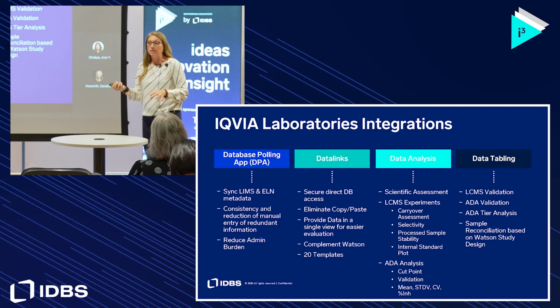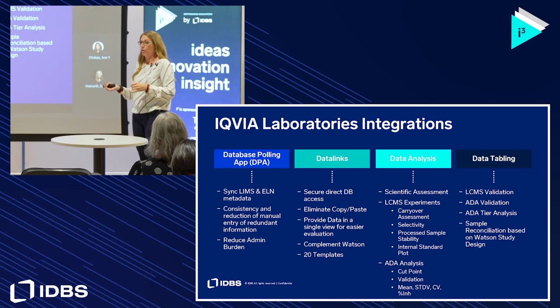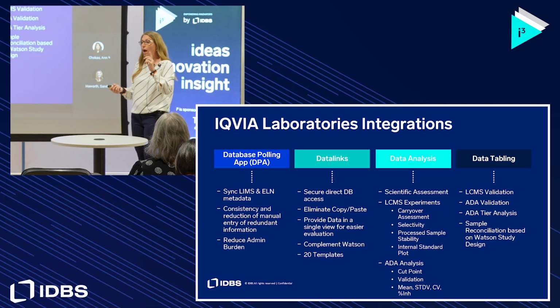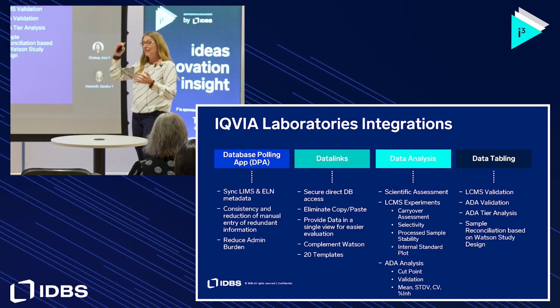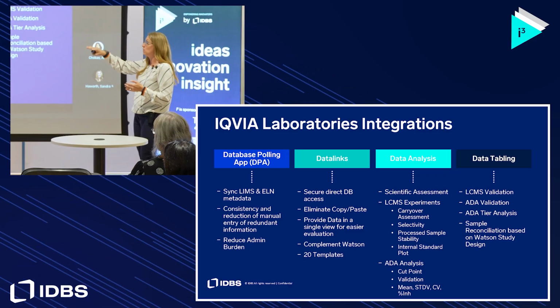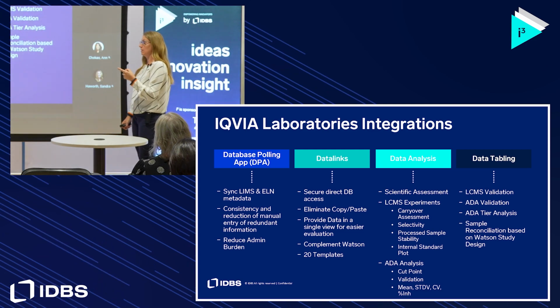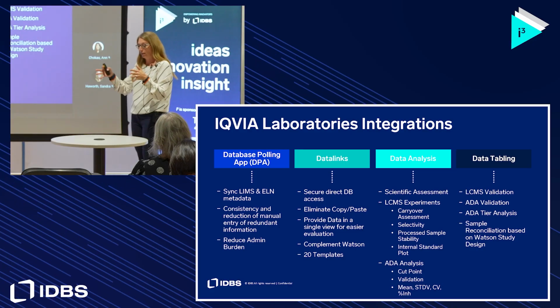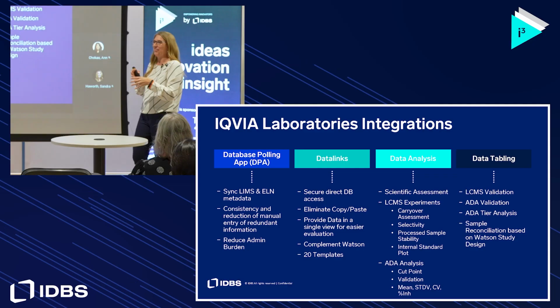If you're using a LIMS system or some other system, you want to essentially automatically create studies in ELN. So I don't know if you're an administrator and you have to build those studies, or if you give users permission. And I don't know if you see inconsistency in that structure, but that's one of the reasons why we want to sync with the LIMS system. So the DPA, the way it works is it sits between Watson LIMS and ELN, or IDBS Polar. It's very hard to change after you've set that for a very long time.